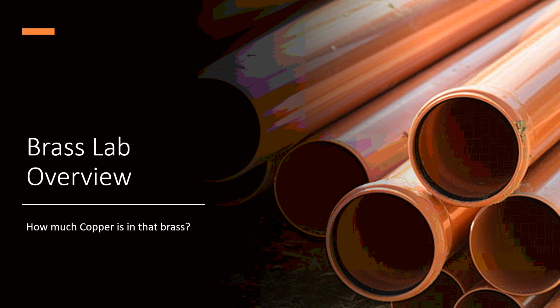Hi, this is Mrs. Nearing, and in this video, we're going to talk through the analysis of brass lab. Our goal in this lab was to figure out how much copper is in a sample of brass. So our end calculation is going to give us a mass percent. So we'll be able to say, okay, this sample of brass is 10% copper, or 20% copper, or is it 30% copper? That's what we're trying to find out.